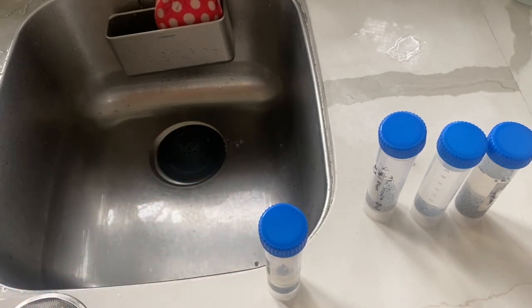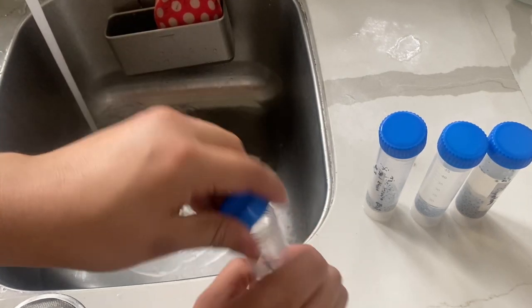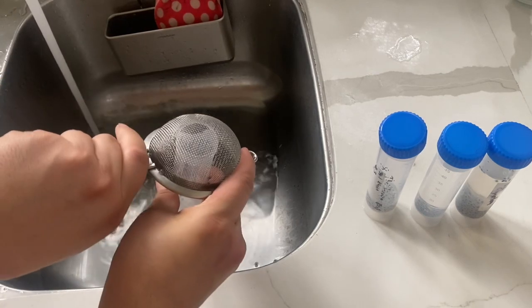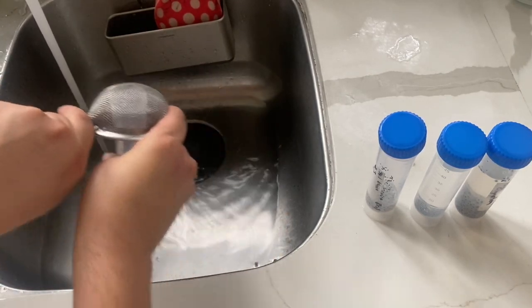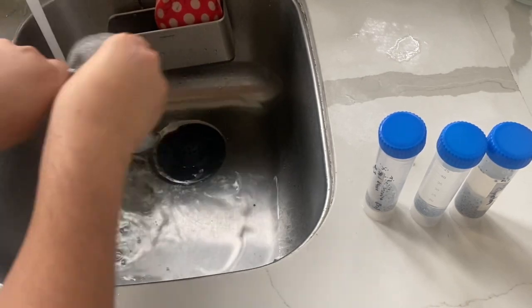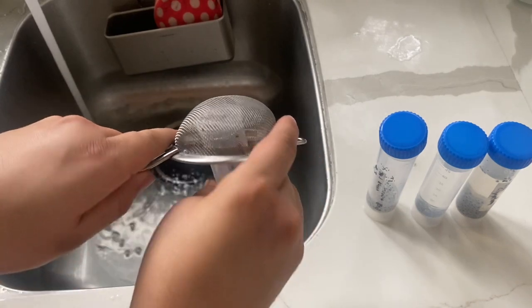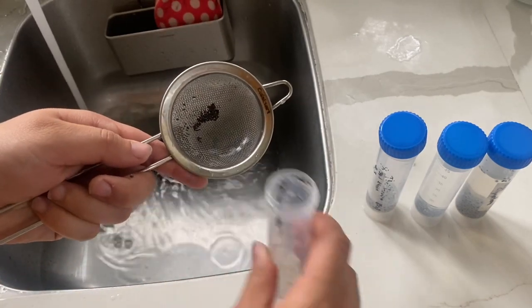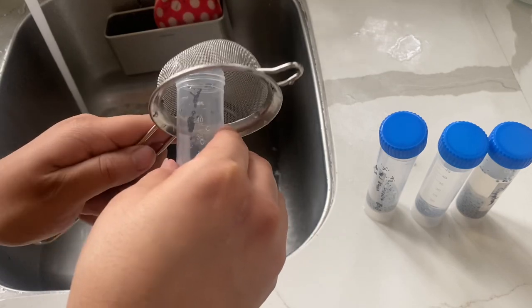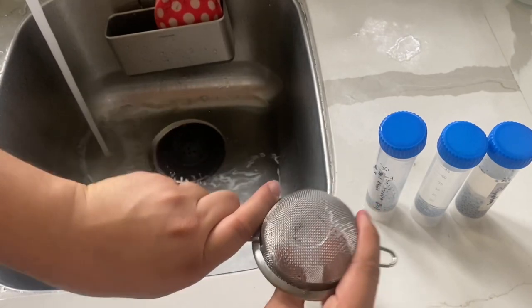So first, turn on the water, not too hot. I'm gonna go ahead and dump them out. So I dump like that and then hold it. That way I can just keep rinsing without losing any of my seeds. So if I do, I'll scoop like this just to get them all together. Once they're all together, it's kind of not like that.